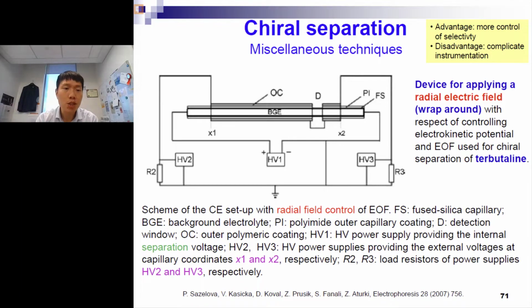The advantage of this, although it's quite unique and less mainstream, is that a new separation mechanism can be introduced. So basically in research, we have a hypothesis, we try, and then see, oh, it can separate with better efficiency or shorter time, but because the construct of the infrastructure is different, we can still publish something and let people imagine what can be done in the future. Now, the disadvantage is that this instrument is more complex because, compared to the two ends where we apply voltage, now you have it around in the middle. So you need to have a bit more complex engineering.